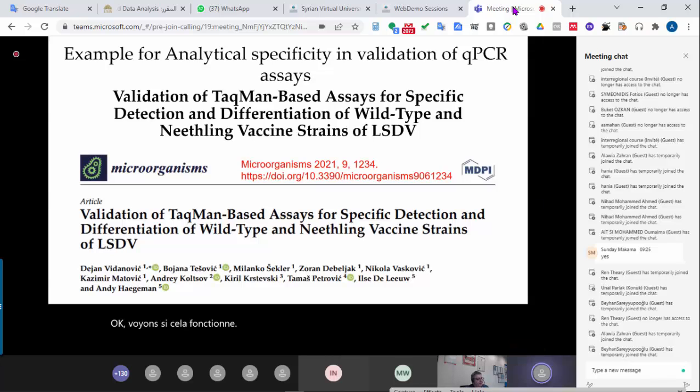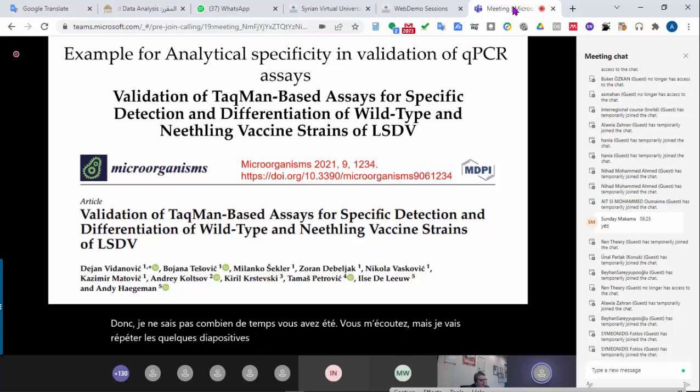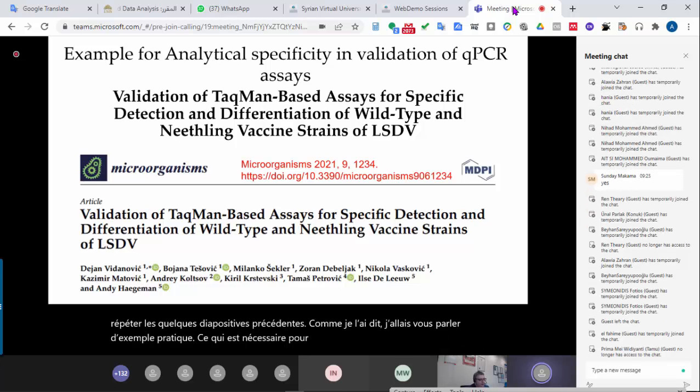Okay, I do not know how long you were listening to me, so I will repeat the previous few slides. As I said, I was going to tell you about a practical example of what is needed to validate one assay, and also what is needed to verify the same assay that is already validated in some other laboratories, so we can see the difference, and the difference is very big.